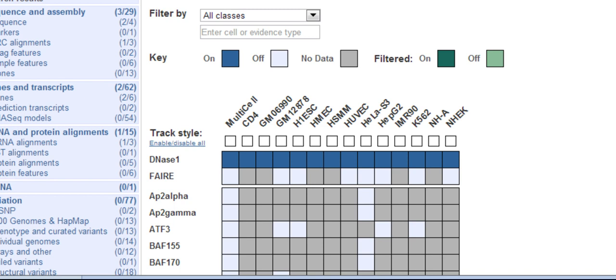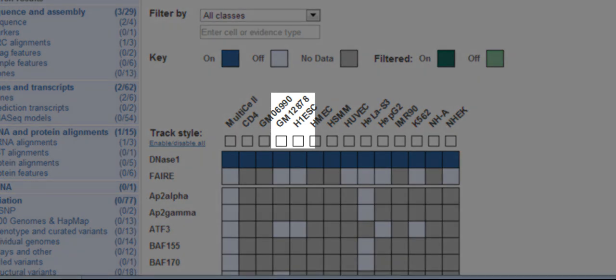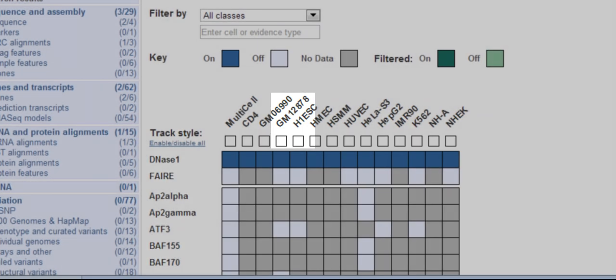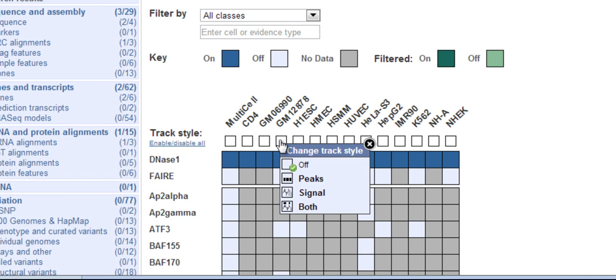Clicking on the box underneath the cell line GM12878, which is a lymphoblastoid cell line, I have the option to draw the data as boxes, a signal track, or both. I'll choose both for now.